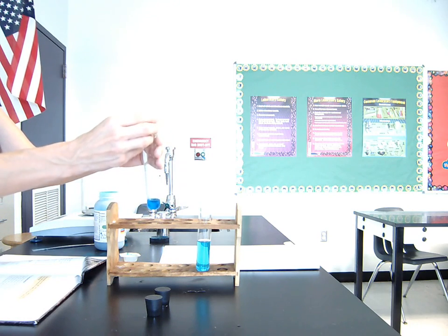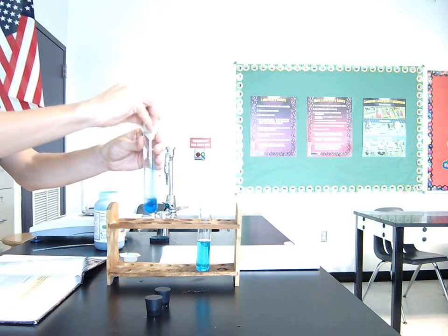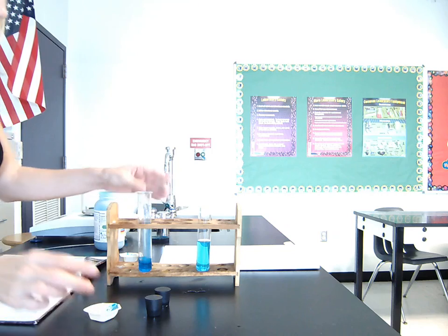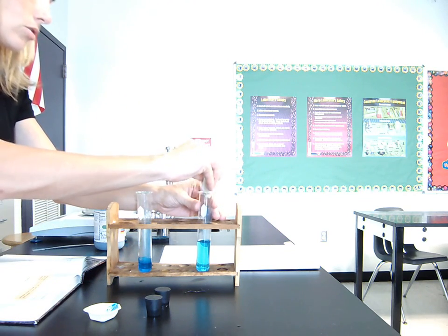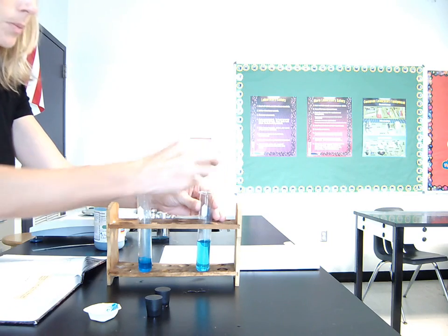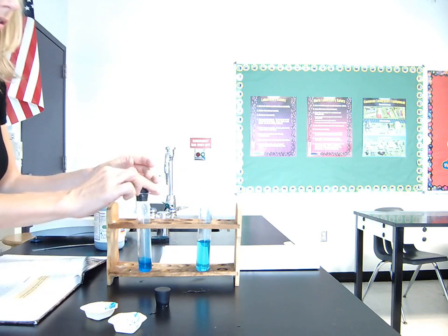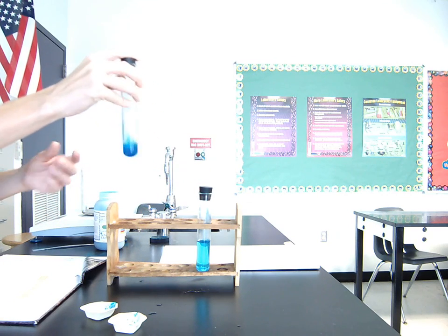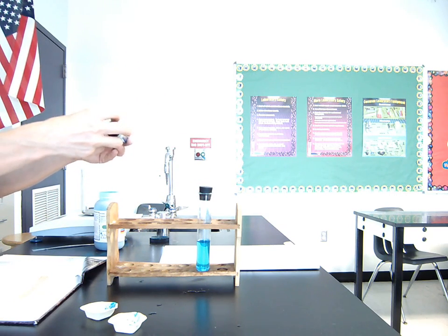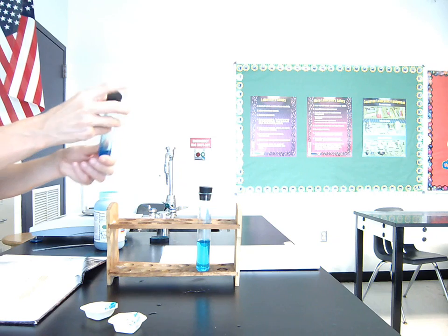In this case, our blue stuff is the solute, and the liquid that it's being dissolved into is called the solvent. So the solvent in this case is water. The solute is blue stuff, which, more technically, is called copper acetate.